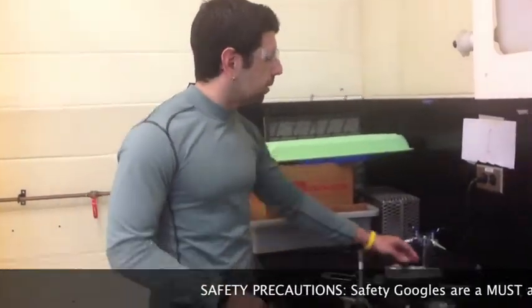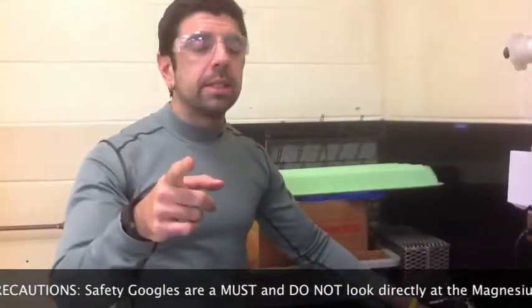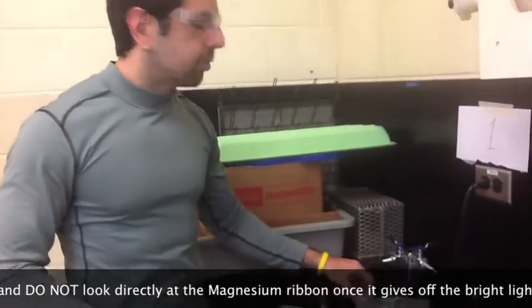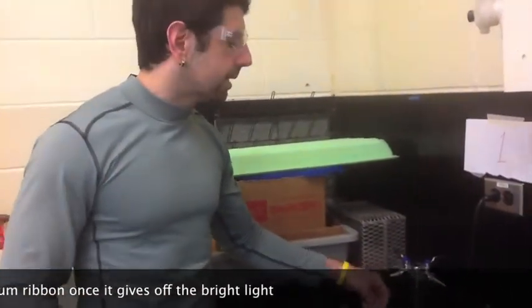In this station, we're going to burn a piece of magnesium ribbon. In order to do that, we need a couple of things. First off, safety goggles for all these stations. A must. I'm going to be looking out for that when you're working on the lab, and so will your lab teacher if you're not actually in one of my classes.